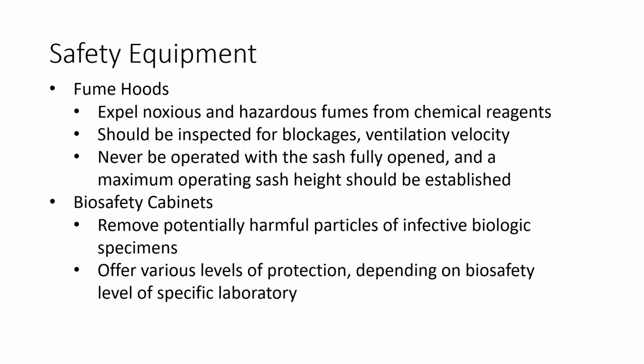In microbiology, when we receive specimens down to the lab, we're typically going to be doing all of our plating underneath the biosafety cabinet. And we're going to open up the patient specimens and plate them and do our gram stain slides and everything underneath the biosafety cabinet. And then the biosafety cabinet is routinely cleaned, and most of them have a UV light, and UV will kill most microorganisms. It won't kill really tough resistant microorganisms, including endospores, which are a huge issue. And that's where we use disinfectants and such to clean out the biosafety cabinet. Biosafety cabinet is rarely encountered in the clinical chemistry area.